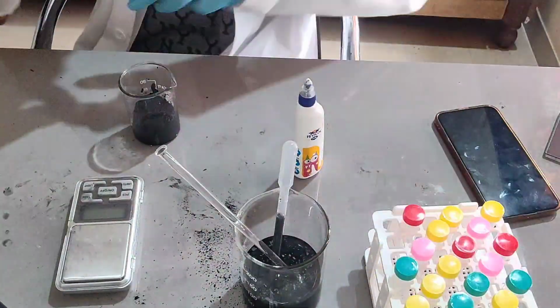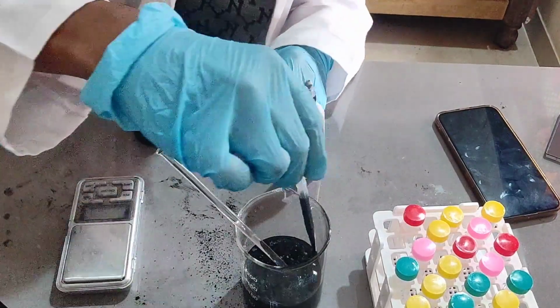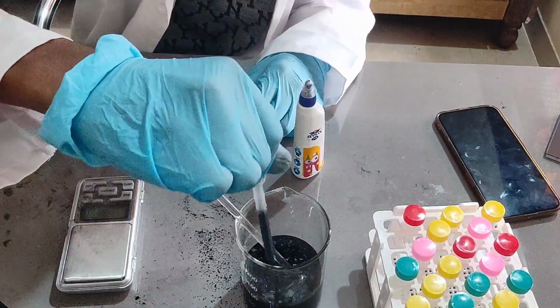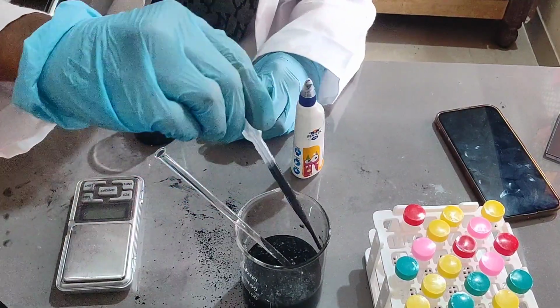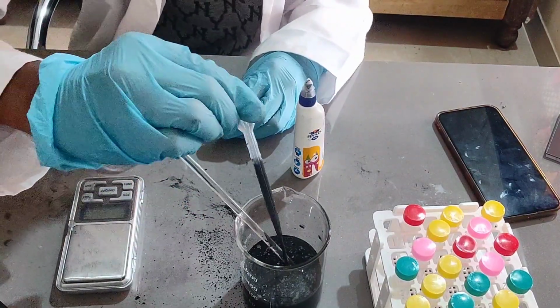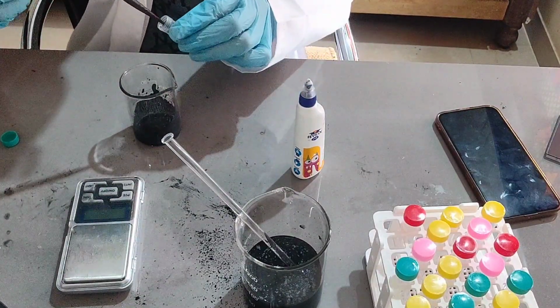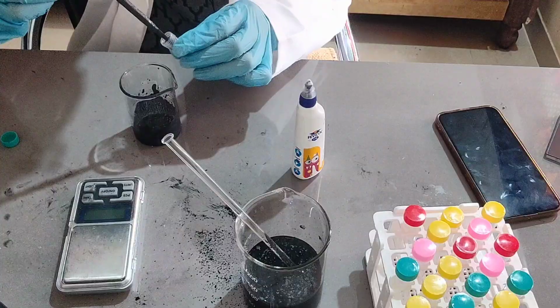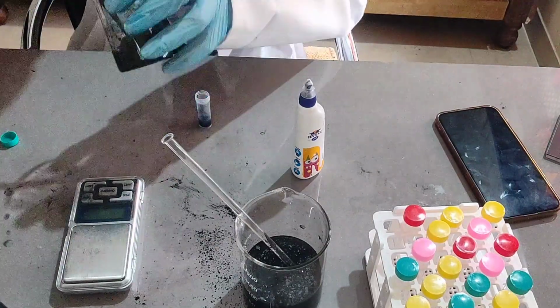These vials have colored caps, so I can color code my samples. So what I have done is I have kept the yellow ones for the initial 20% concentration, the green ones for the 10%, the pink ones for the 5% concentration.